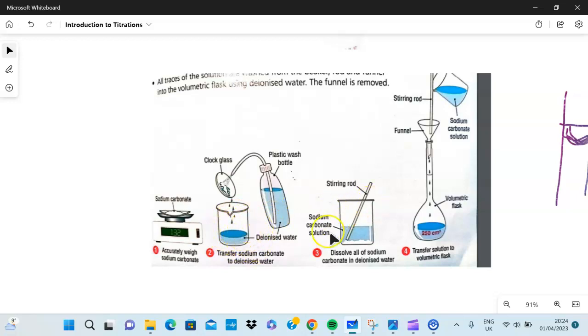Keep that aside, take a funnel, put that on top of a volumetric flask. A volumetric flask is this large, somewhat roundish flask with a flat bottom and then a narrow neck. There is this line and that line is called a graduation mark. Anything up to there is the volume written on that volumetric flask. This says 250, so any solution up to that exact mark is 250 cubic centimeters.